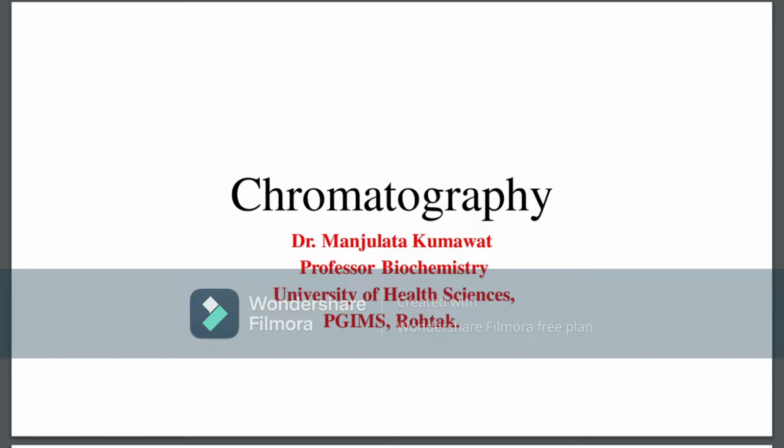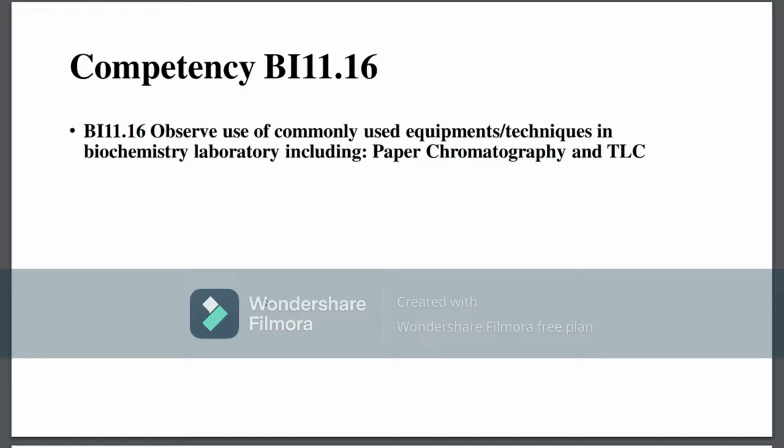Hello students, I will be taking a class on chromatography today, and this lecture is only for MBBS students. Please remember, this is one of the competencies, 11.16: observe use of commonly used equipment or techniques in the biochemistry laboratory, including paper chromatography and TLC. So we will be asking only in the form of a spotter or OSPE.